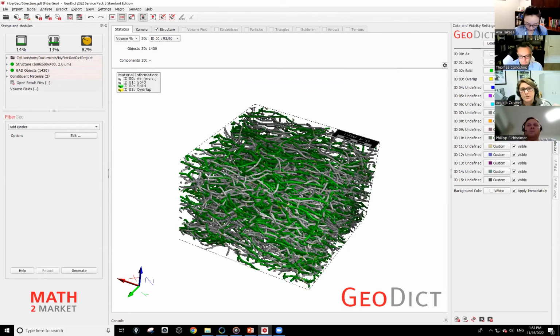But basically, you saw the process of how we segment, how we analyze, and now how do we start to create models. And what I want to do is to go back, and we're going to wrap up for the day.